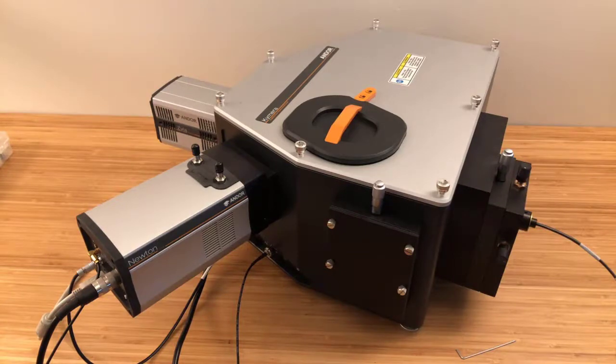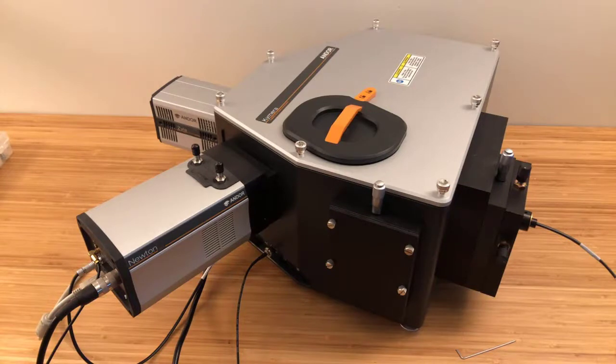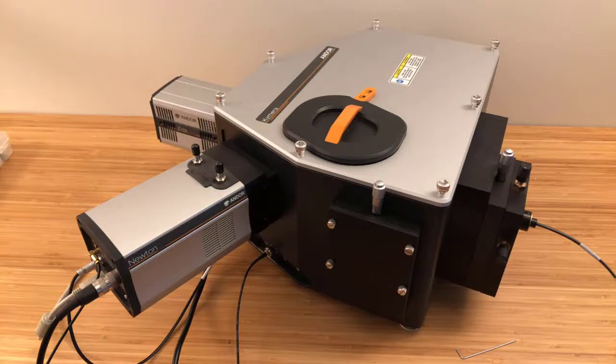First, what is the Kymera 328i? It's a Czerny-Turner spectrometer, focal length 328mm, f/4.1, with a quad-grating turret, and it can be configured with up to two light inputs and two camera or slit outputs.